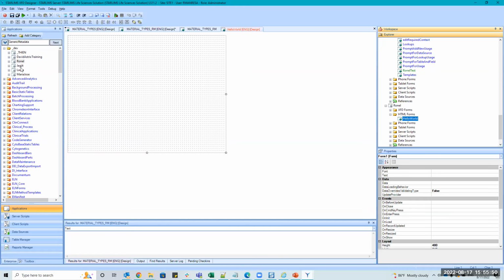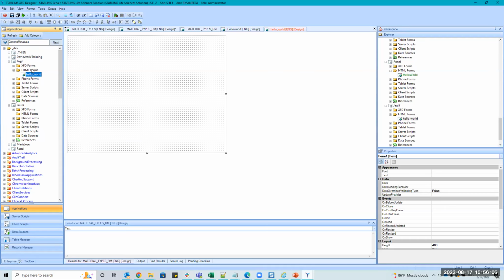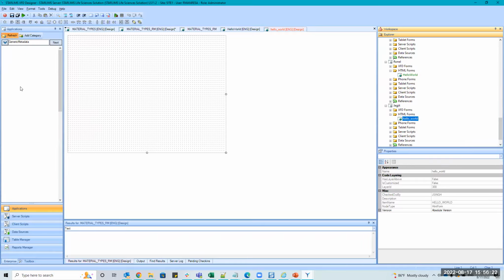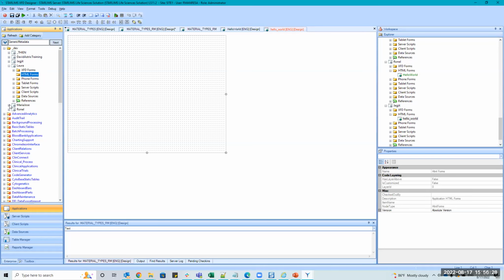I can see these here doing it. So let's see, Laura, not yet. Jajid, yeah, Jajid is there. Cool, Jajid, nice. So by the way, look, he has it, it's red. So that means it's checked out to him. Okay, so checked out by him. We have all these options here we need to go through, but one thing at a time. So let's see, Laura, refresh. Okay, Laura, we're missing, and MJ, we're missing.